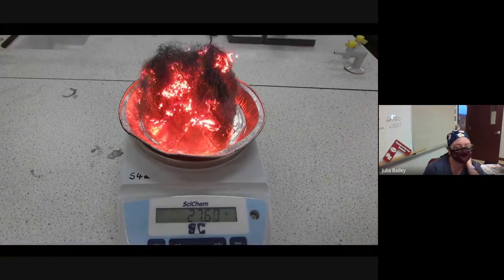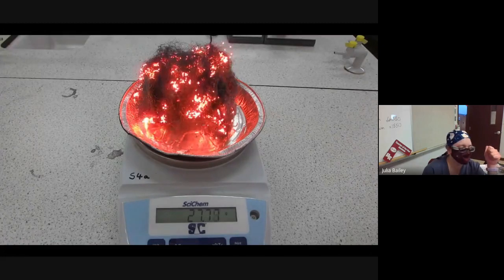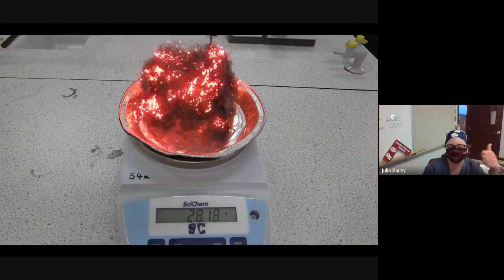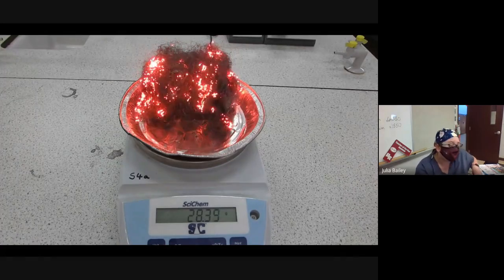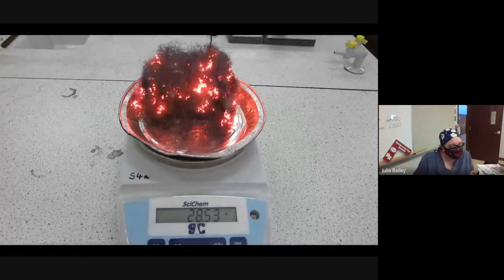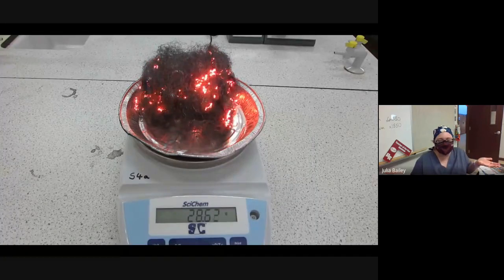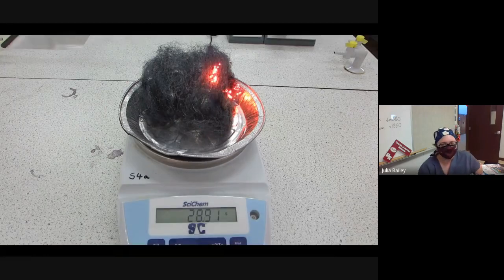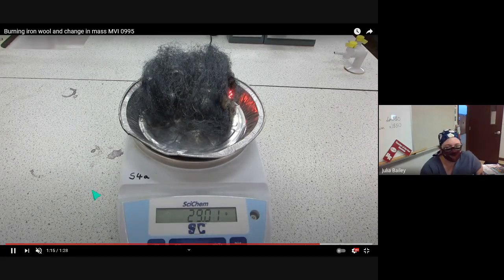But then suddenly that mass is skyrocketing. It was at 27.35 before they set it on fire. Now it's past 28. It's just going, going, going. That mass is going up. Why is something getting heavier while it's burning? What? Why does that happen? And the answer to that question is what this lab is about. This video is just a shorter version of the same basic thing that Mr. Dado is doing, but I wanted to emphasize what's happening here. As the fire is almost out, the mass is now up over 29, and then it ends up stabilizing at 29.10.